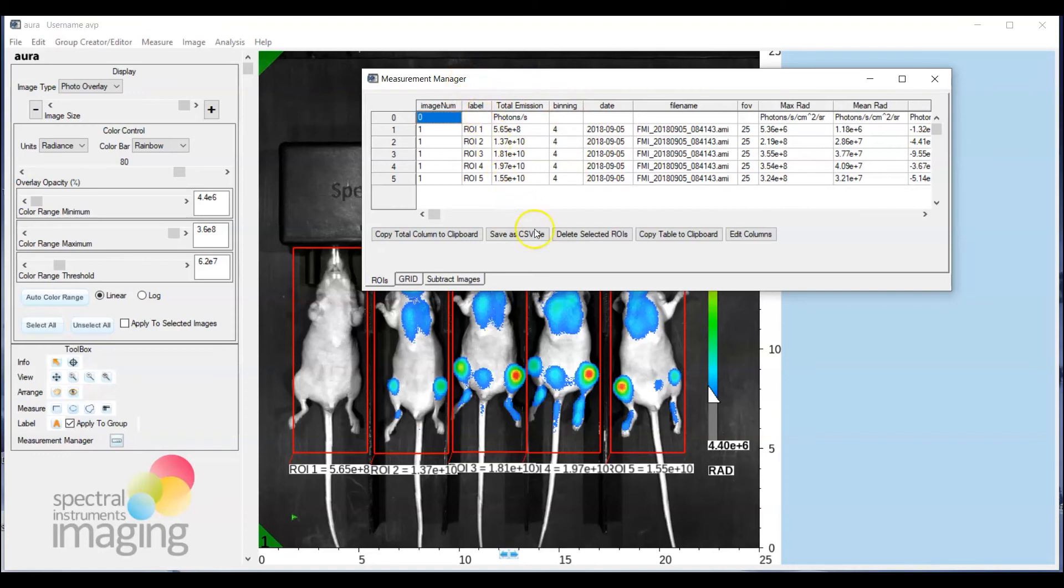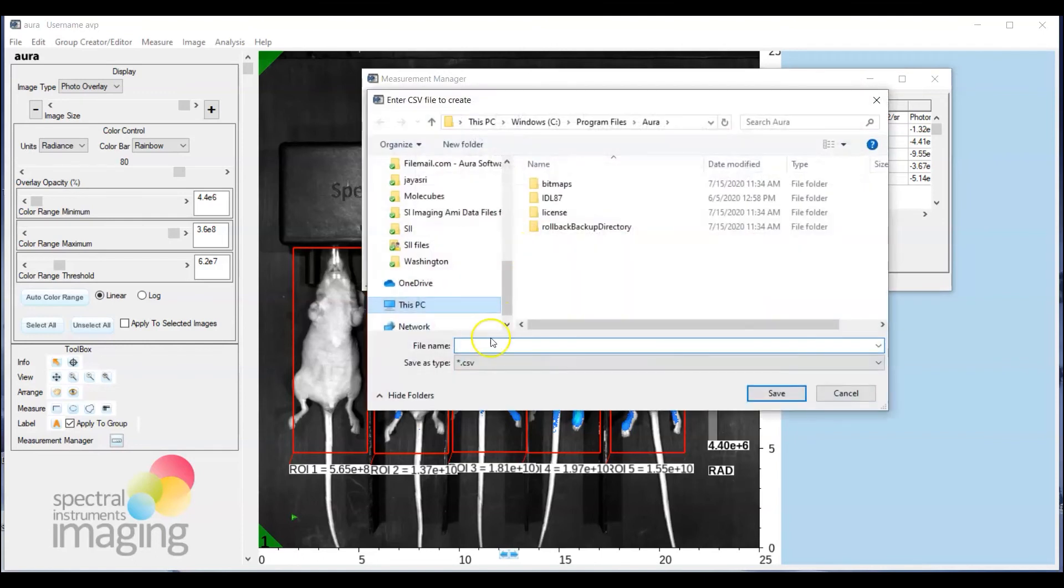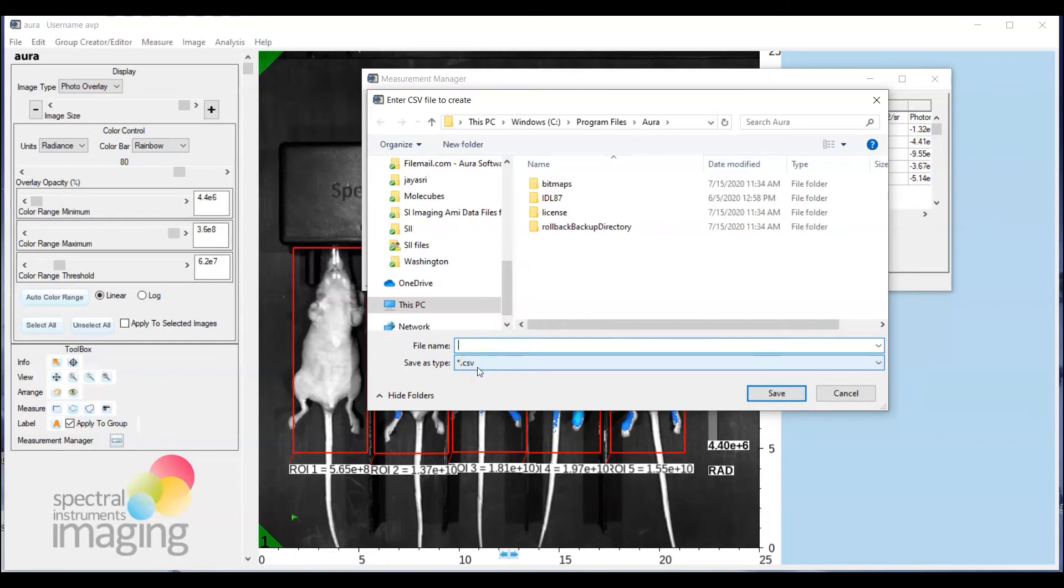This can get exported as a CSV file, so you can basically save it to where you will save it with the CSV extension, open it up in your software of choice and save it appropriately and do additional analyses and graphs.